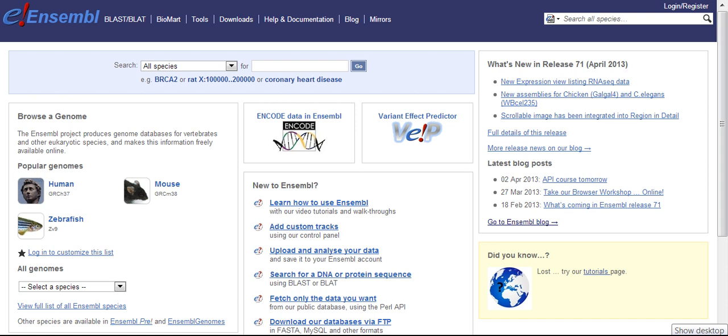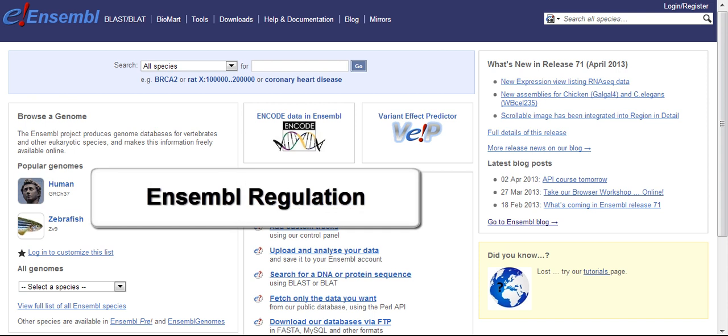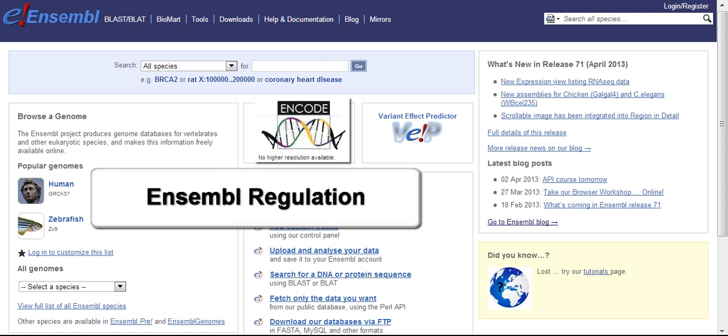Hi, I'm Julieta from the Ensembl Outreach Team. This video addresses how to identify sequences that may be involved in gene regulation along the genome, most of which is based on ENCODE information.